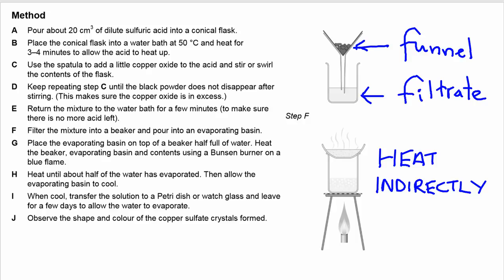Labelling diagrams. So obviously we've got the filter paper, we've got the filter funnel, and the solution in here is the filtrate. So that's actually going to be, I think in this example, our copper sulfate solution.